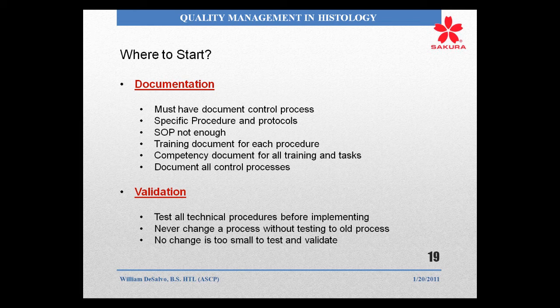I've also been involved in CAP inspections. You go in and all I have is the SOP. Well, that's no longer acceptable if you are CAP inspected or CLIA inspected. You have to prove that not only do you have a standard operating procedure, but how that was arrived at, who reviewed it, who actually implements that, and that you have control of that whole thing. Competency. Training documentation is very, very important.